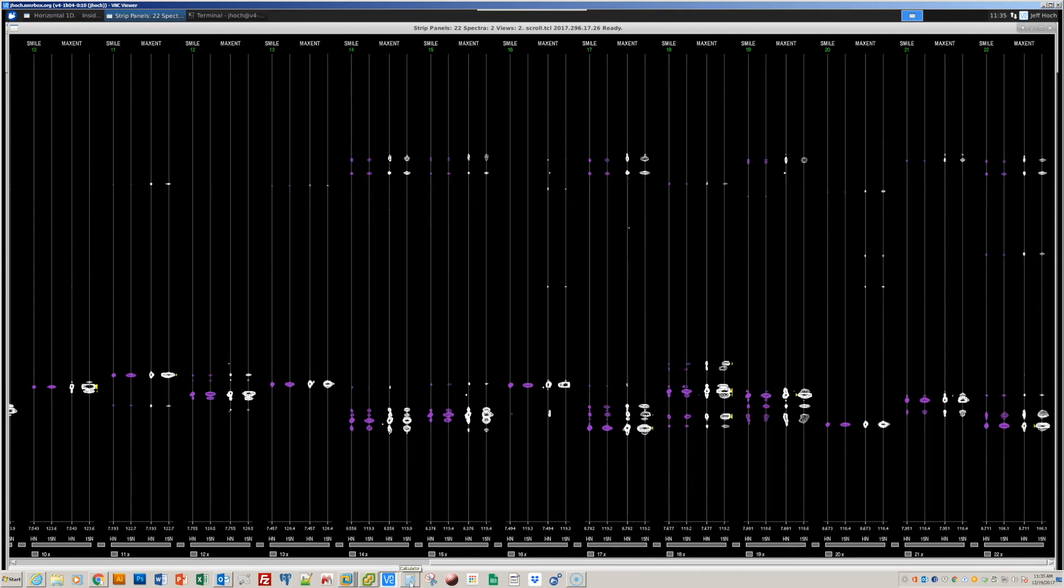So, those are the steps that we need to reconstruct non-uniformly sampled data with NMR pipe. You saw it first on NMR box.